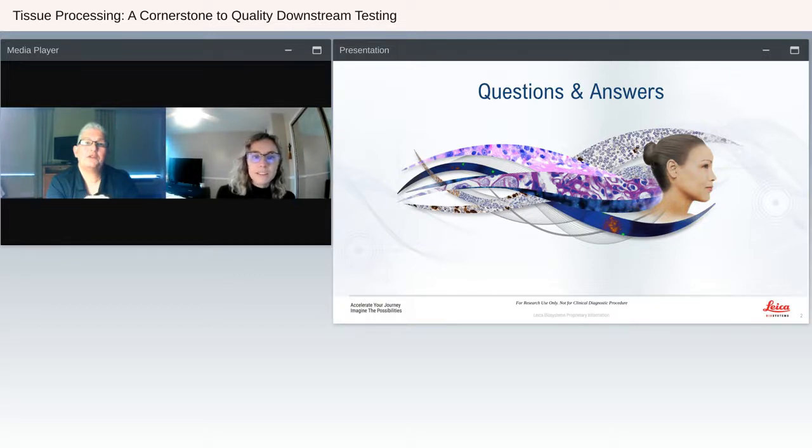Well, we could do another question if there's another one. Okay, great. Let's see. Any particular tip for cutting mouse or rat bones, considering they're well decalcified? Angles for cutting or water temperature suggestions? Sure.